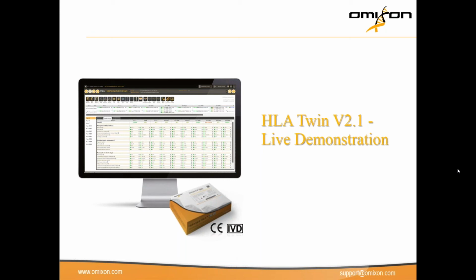Hi all. So we did have some questions during the demo. We are still welcoming questions. If anybody is having one, please submit your questions in the questions box or on the chat box. So first question is for Mette, I believe. Did you use the 500 or 300 cycle chemistry on the MiSeq for your initial manual work, or did you change it after you switched to using the automated workflow?